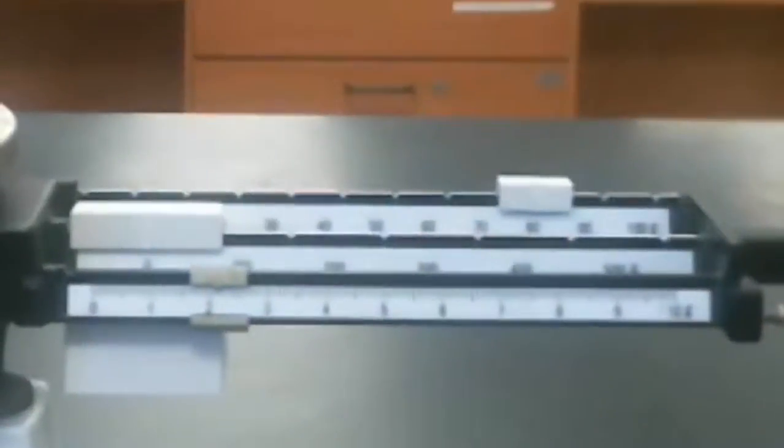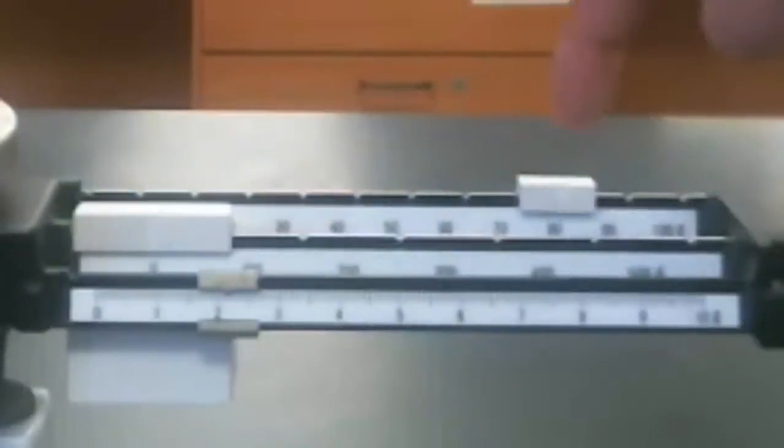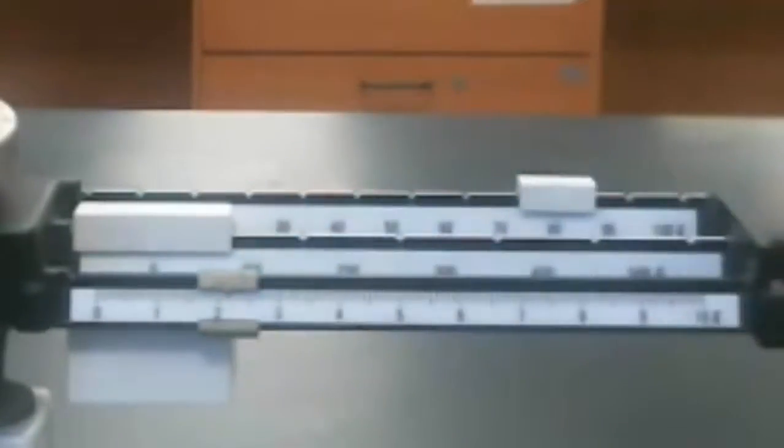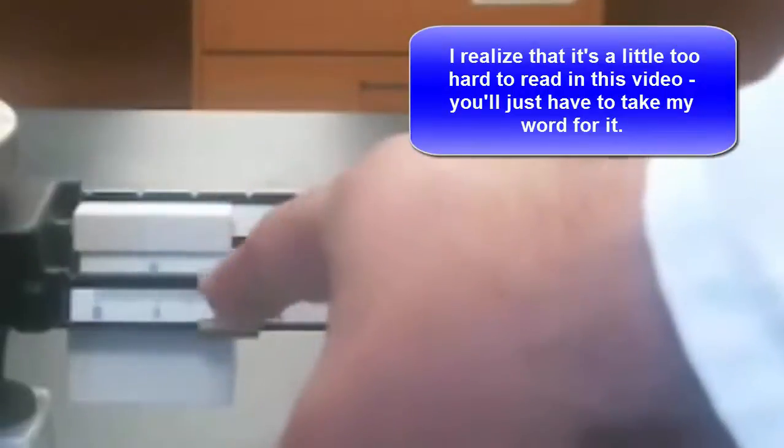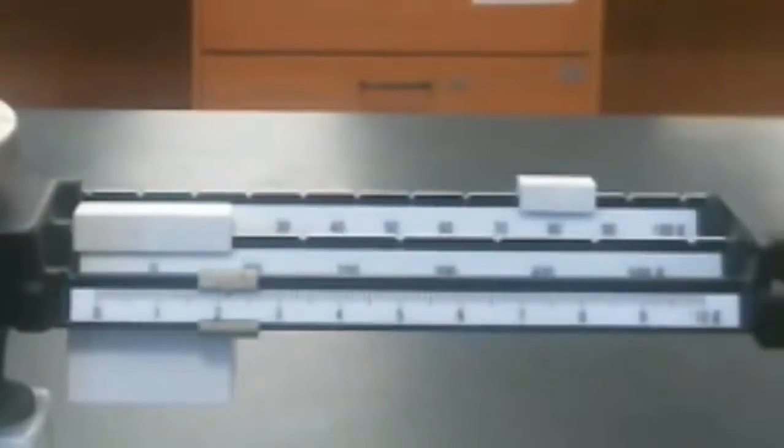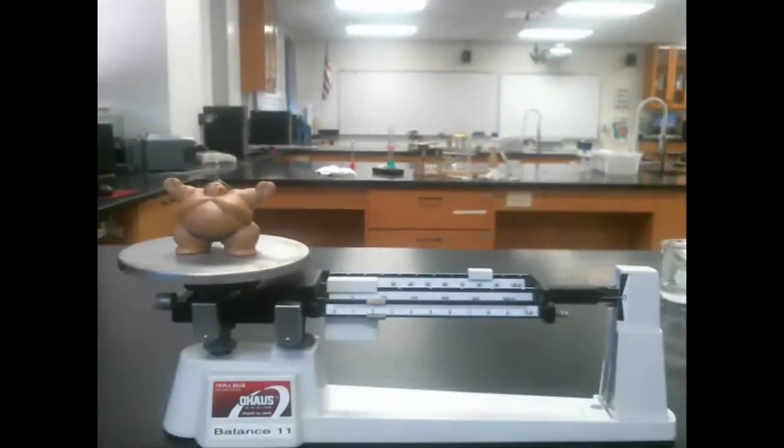So how do we determine his mass? We add. There are no hundreds. There are 80 tens. It's past the two line, 82. And about one line past, maybe a little bit more. We'll talk about some specifics about reading between the lines. It's kind of important to do that. So I'm going to say that it looks like it's just a little bit past the 82.1 line, and I'm going to call that 82.11 grams. And that would be his mass.